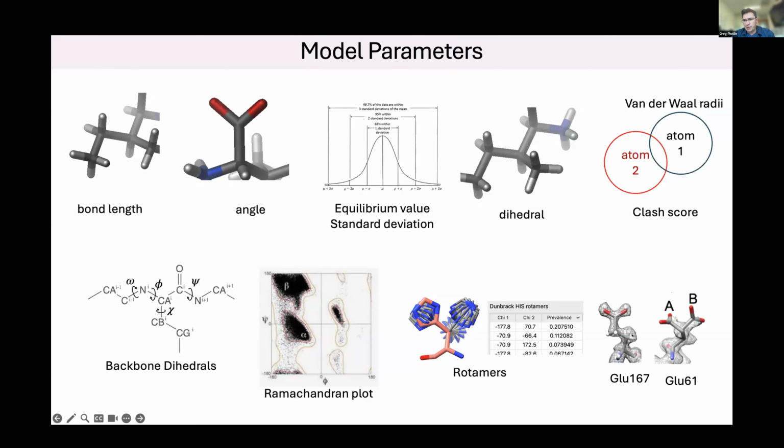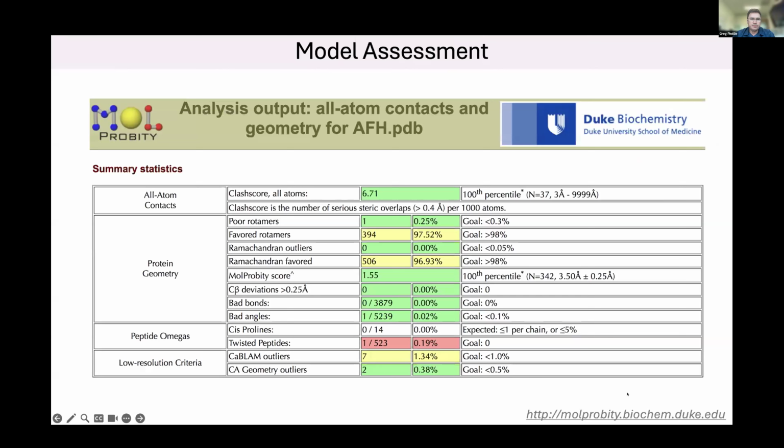And all of this considering that in some cases there might be alternate conformations. In some cryo-EM maps, some side chains can be very well resolved, which means this is a very good fitting conformation. But in some cases, the side chain might disappear in the density, or it might fork like this, and then you can even build alternate conformers.